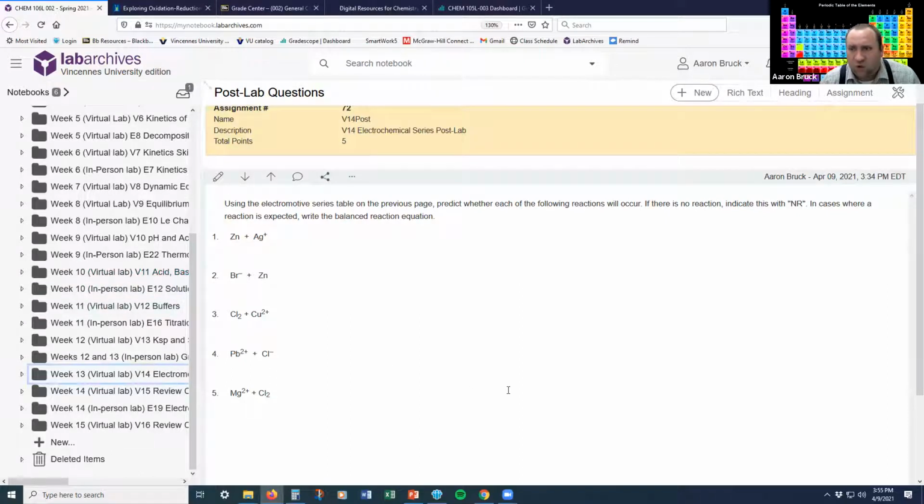So kind of short and sweet with this particular pre-lab and walkthrough. I don't anticipate too many problems. We have done the simulation in the past. It has worked out pretty well when we did. The hardest part with this one, honestly, is just the interpretation, trying to figure out and make sense of, well, this reacted with this and this reacted with this, so what does it all mean? But those are the kinds of questions that can be addressed during the lab while your classmates are working on the other experiment for this week.